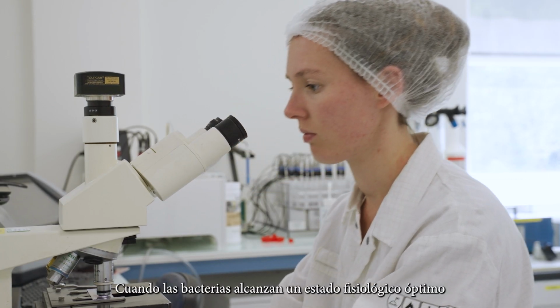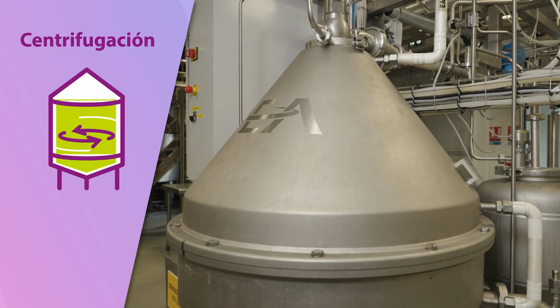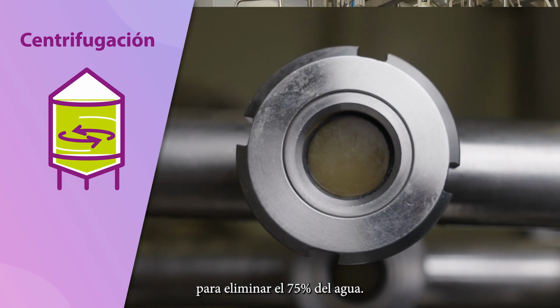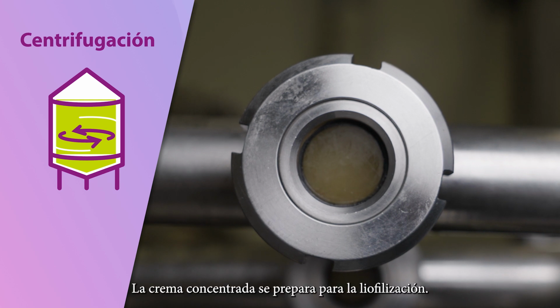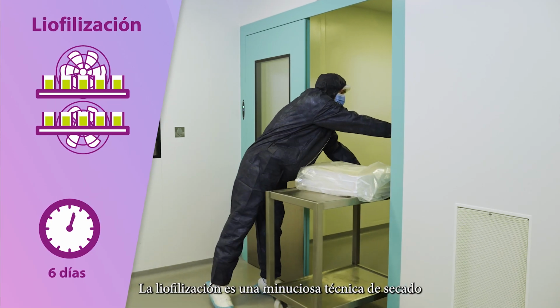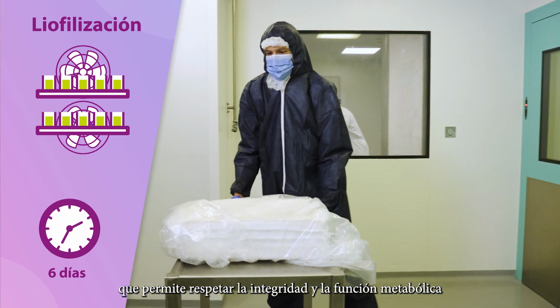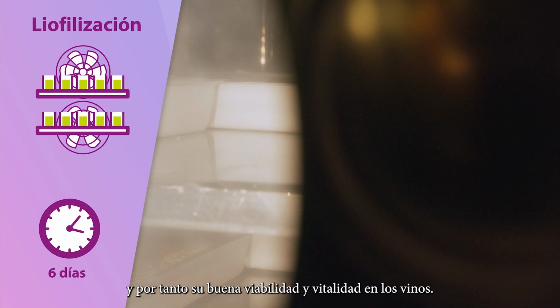We stop the growth of bacteria when they have reached an optimal physiological state. The liquid bacteria are centrifuged and washed to remove 75% of water. The concentrated cream is prepared for freeze drying. Freeze drying is a meticulous drying technique that allows us to respect the integrity and the metabolic function of bacterial cells and therefore their good viability and vitality in wines.